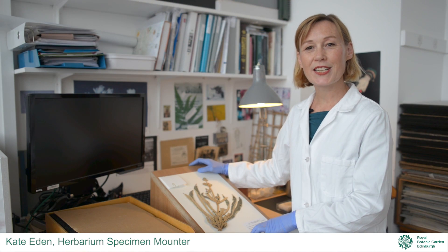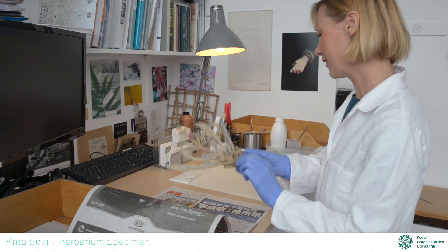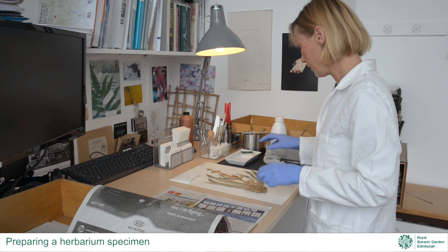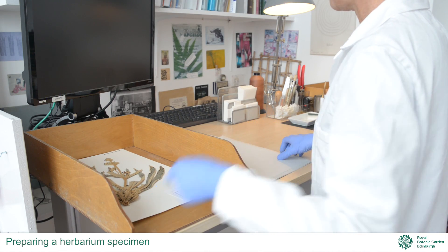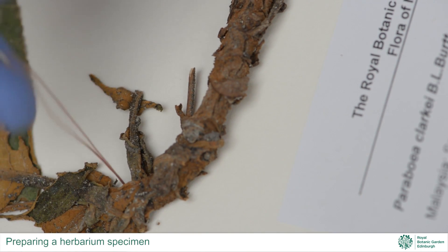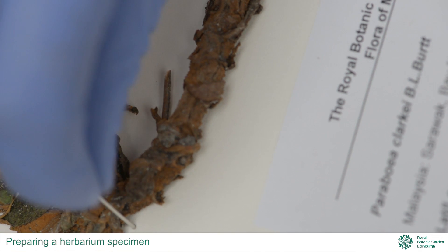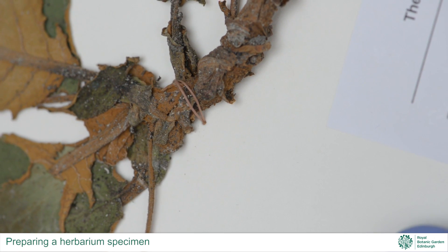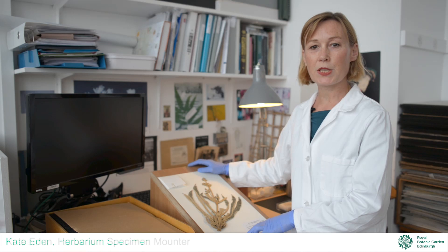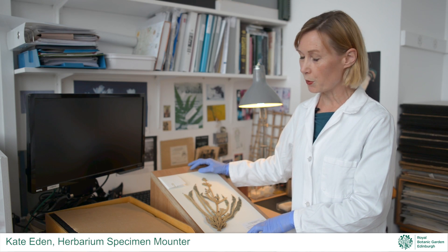After sorting and naming, specimens for the Edinburgh Herbarium are sent for mounting. The aim of mounting is to produce herbarium specimens which display important plant characteristics in an aesthetically pleasing way. They also have to be robust enough to withstand repeated handling so they remain accessible to future researchers. Mounters decide how to arrange the pressed plant, select a sample of loose material for the capsule, and use archival materials to glue, tape, and stitch the plant specimen onto the supportive mounting board.